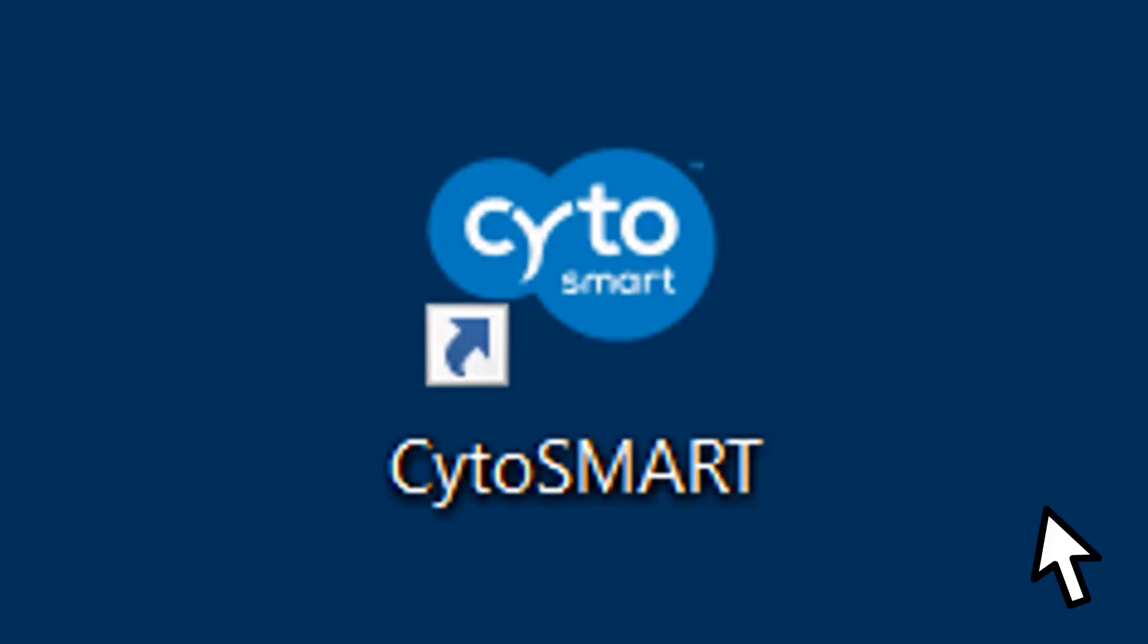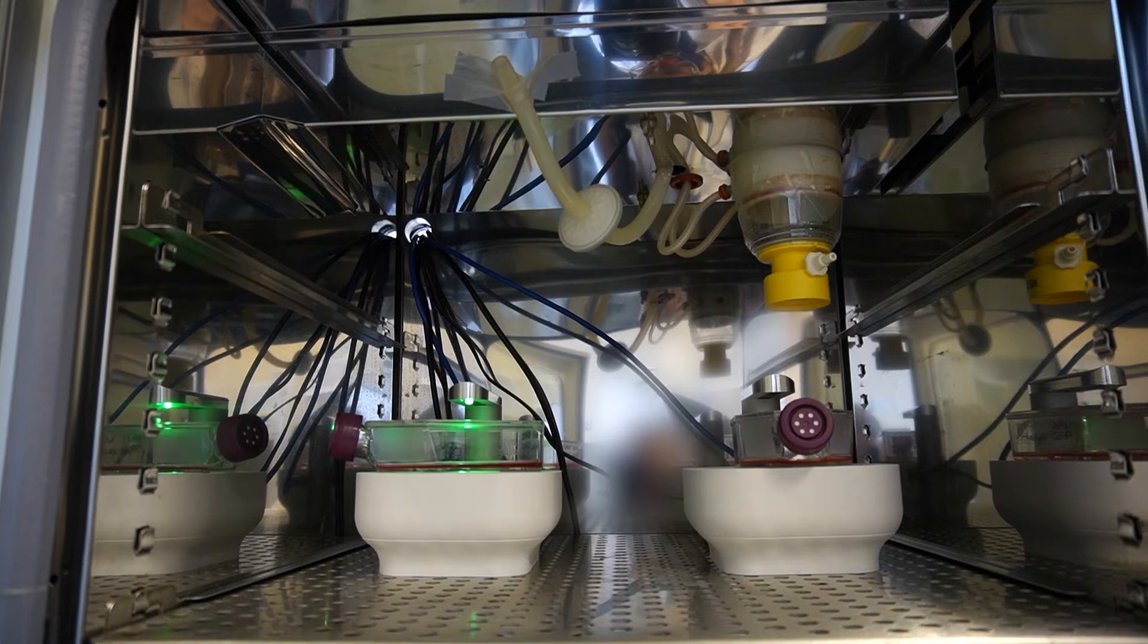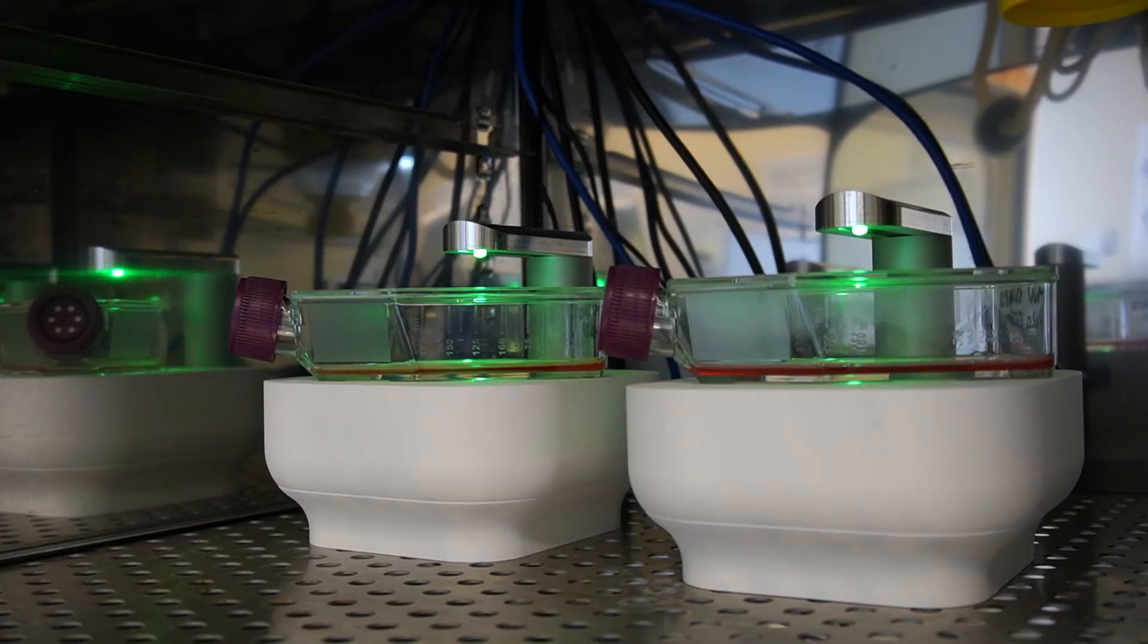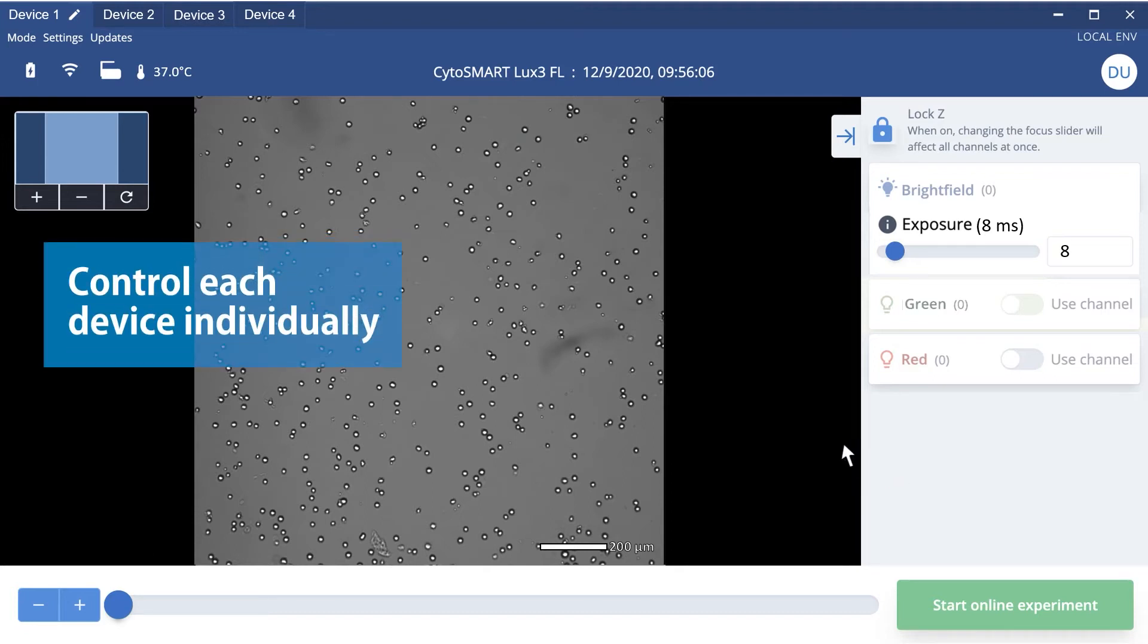Open the Cytosmart app and log into your personal account. The green LED of the device will light up and your cell culture will be shown in the live view. You can easily control each device individually by switching between device tabs in the app.